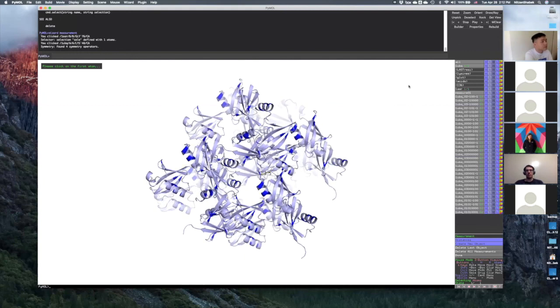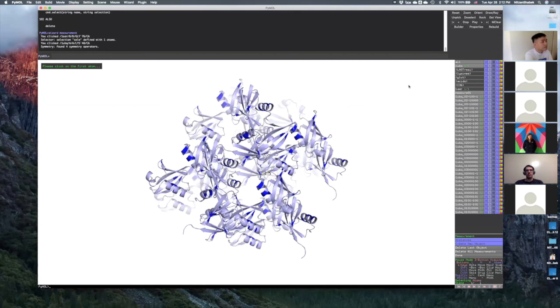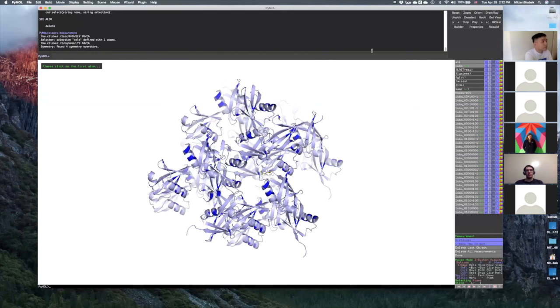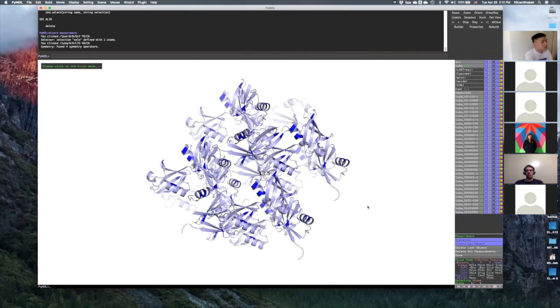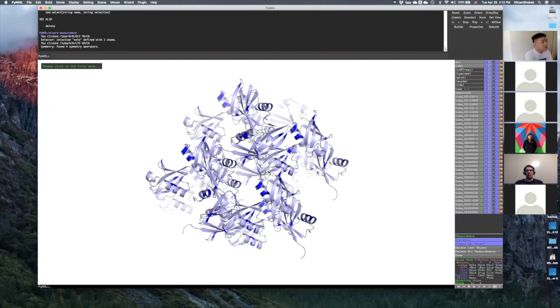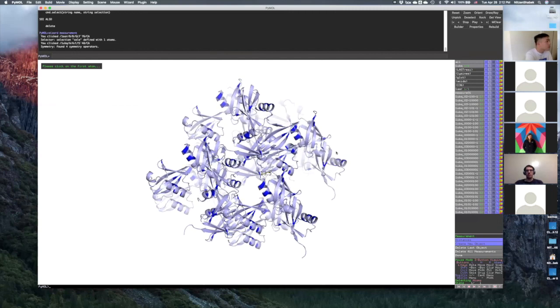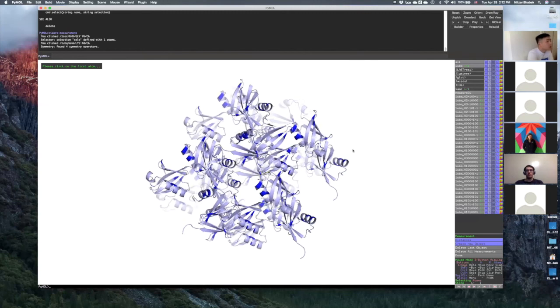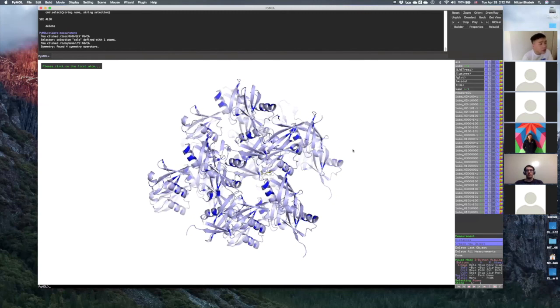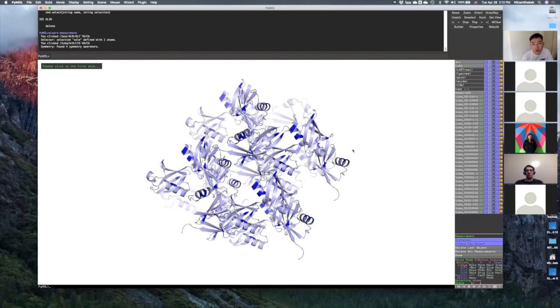We're able to select different parts, color them and save an image. So all these are very, very powerful, and I highly encourage everyone to get as much experience with this as possible. There's so much you can do. There are so many things that I don't know in PyMOL that can be done, and every time I'm surprised to see that there are more things that people can make out of it. So it's kind of cool.